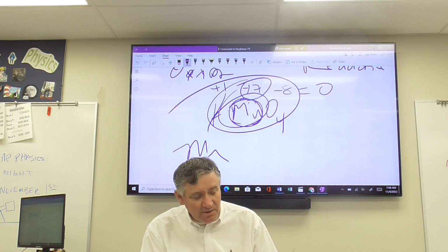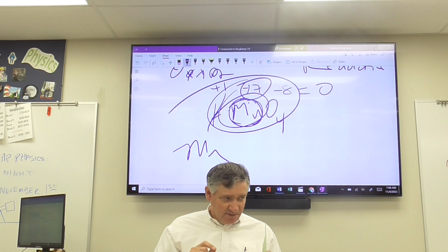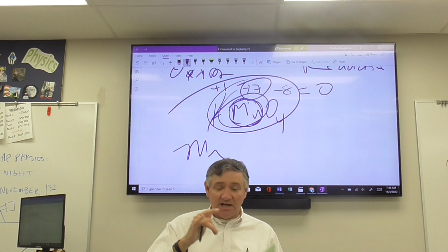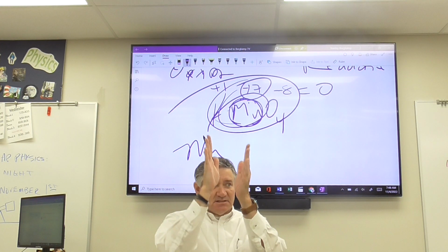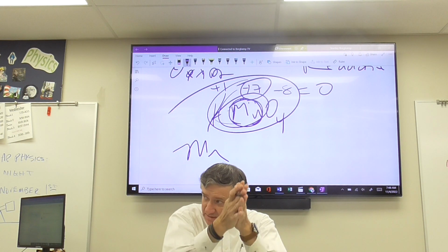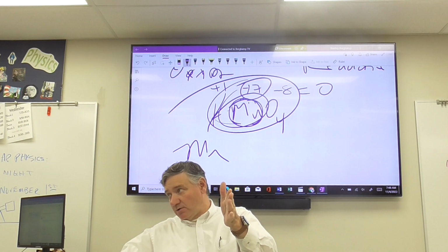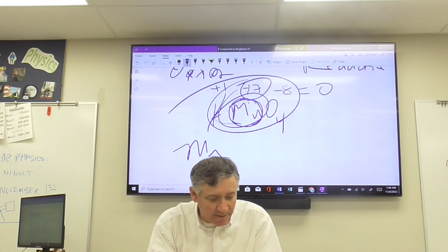So notice on here, you're going to measure out exactly 0.10 grams, okay? Not 0.11, I emphasize 0.10. This has to be exact, because we're going to use this solution as the beginning of everything else that we're going to do. So if this molarity is wrong at the beginning, everything else is going to be wrong going forward. That's why it's so important that you get this right.